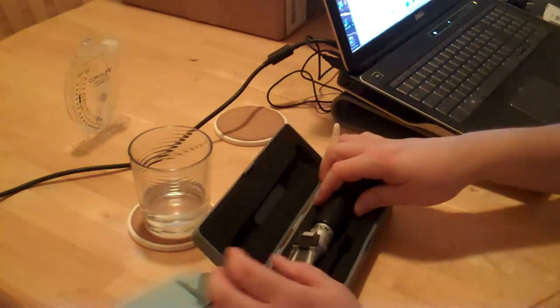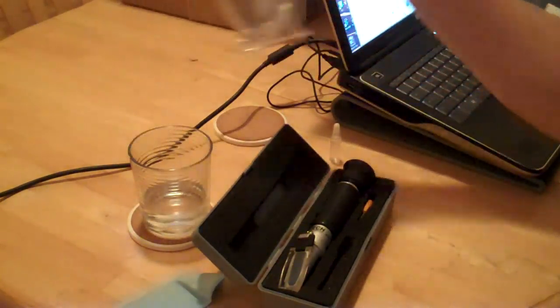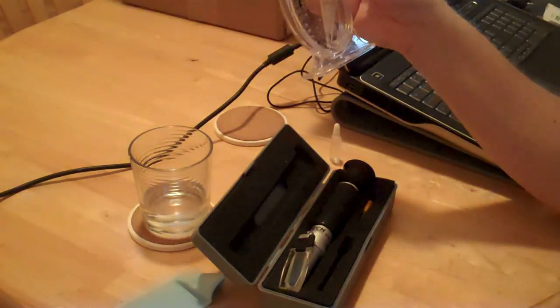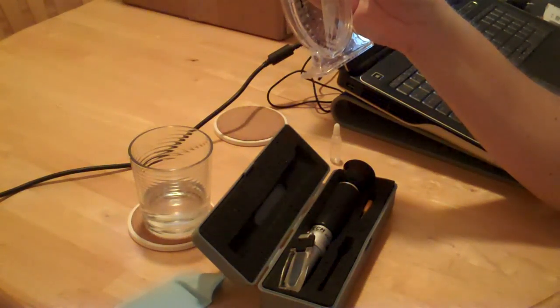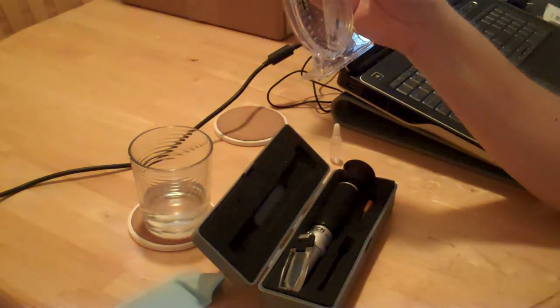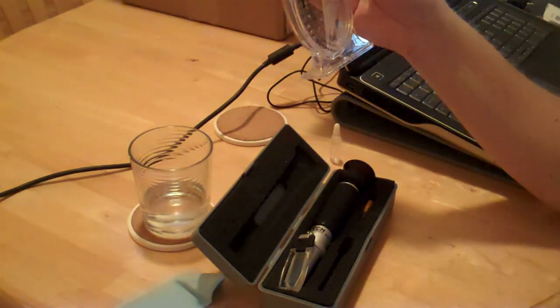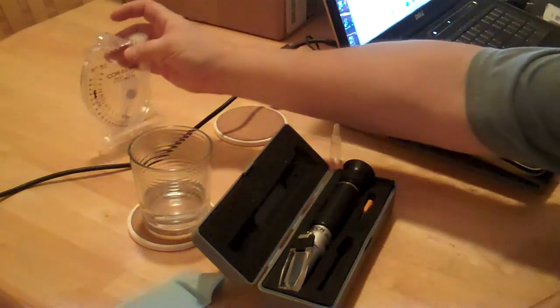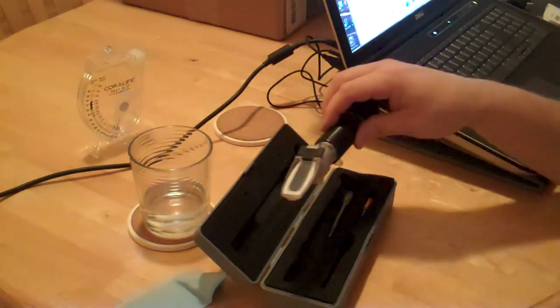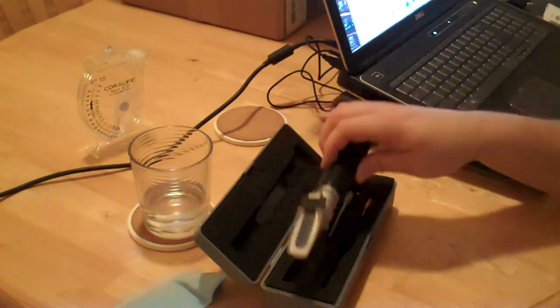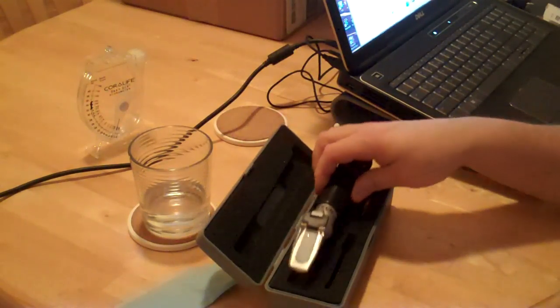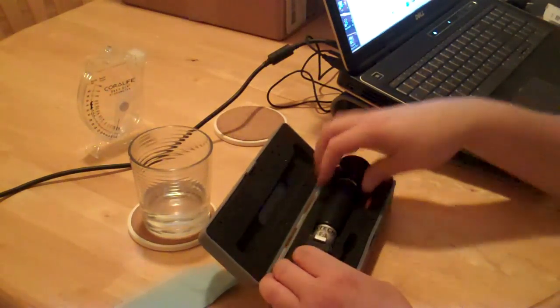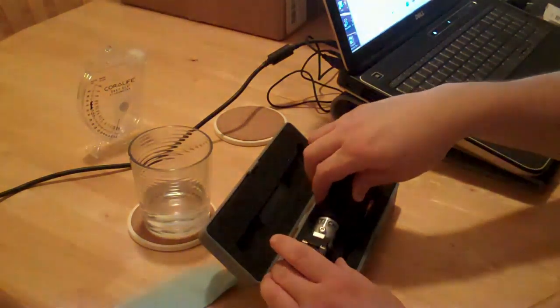This hydrometer read between 1.022 and 1.023. The refractometer read right at 1.026. We know this one's accurate. So that could be a pretty big difference, you know.